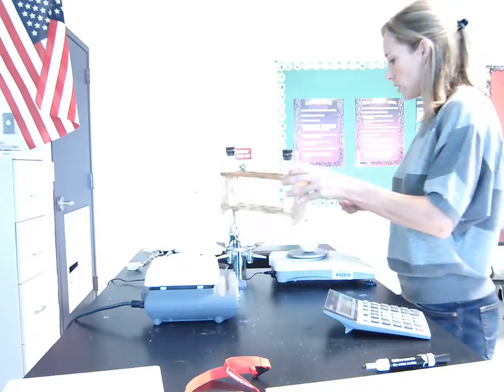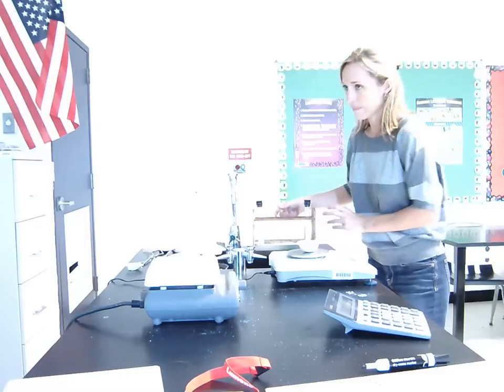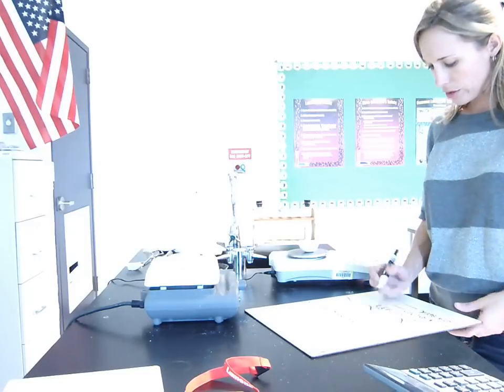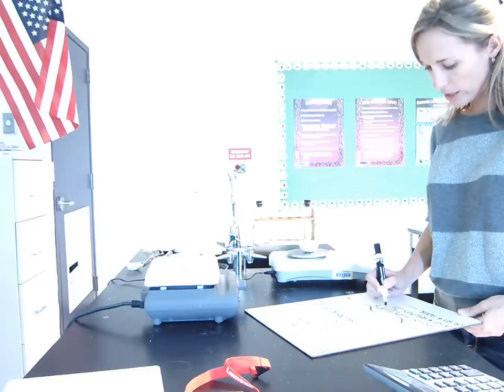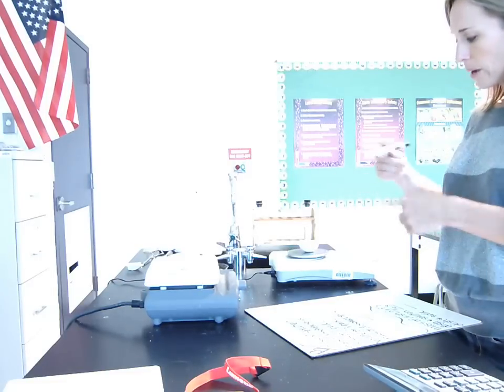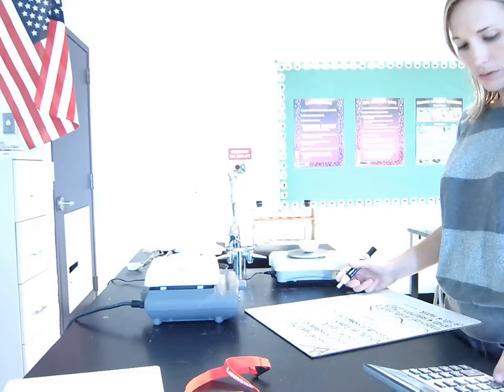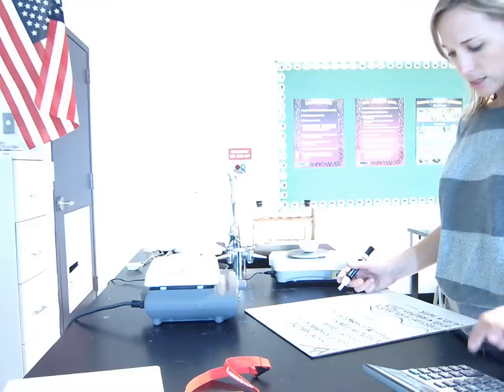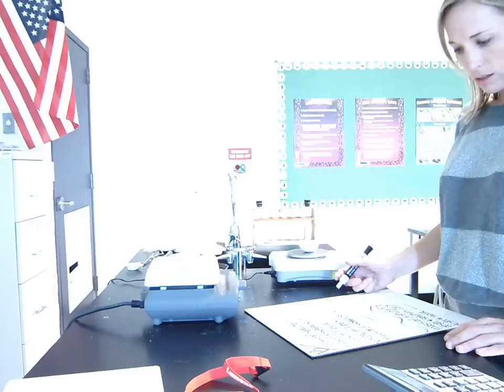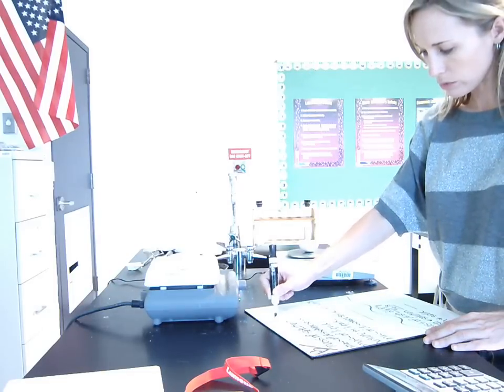Now I can move this out of the way. Okay. All right, so together, the dish plus the solution together is 36.18. And again, I'm going to subtract those, because the dish plus the solution minus the dish tells me how much solution I have. So 36.18 minus 26.87 means I have 9.31 grams of solution.